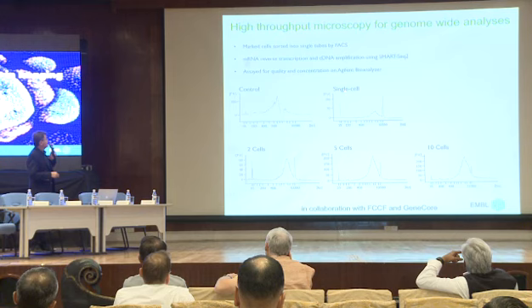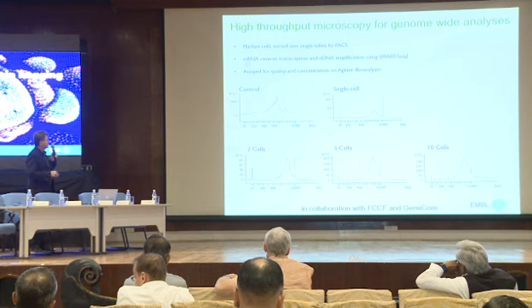We can do, for example, correlative light and electron microscopy with that one by identifying the red cells, for example, in the resin, when they're embedded in resin. Or we can subject such cell populations to flow cytometry and then sort them by FACS, and finally generate cDNA libraries where we can either sequence single cells, or we can really have the whole populations of these phenotypes overall.